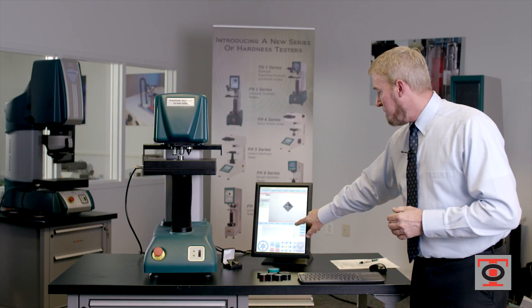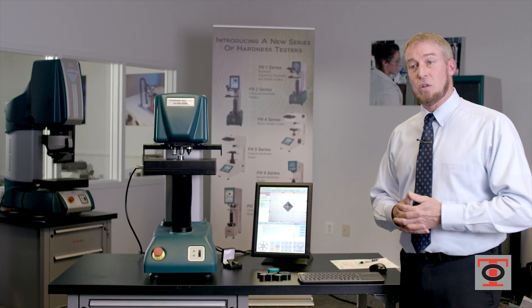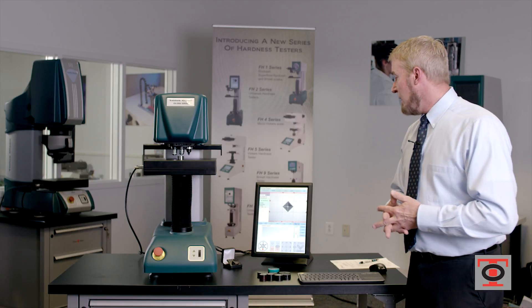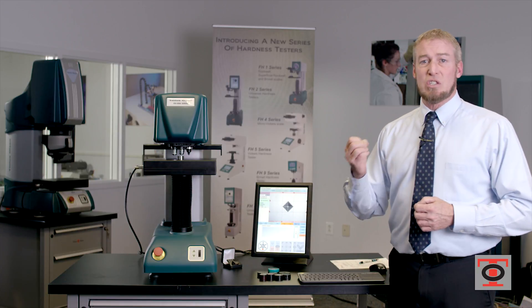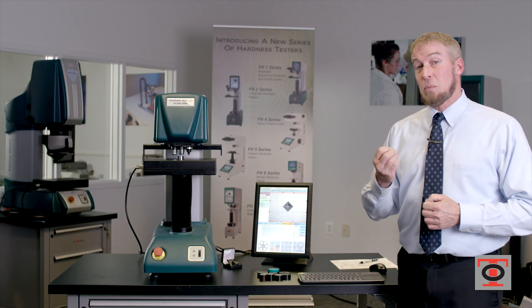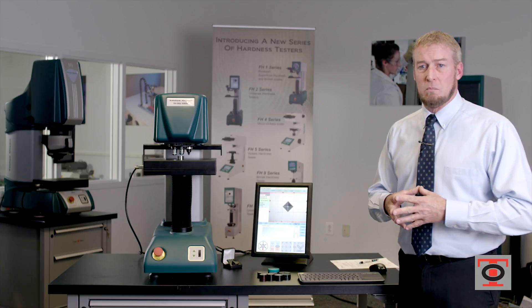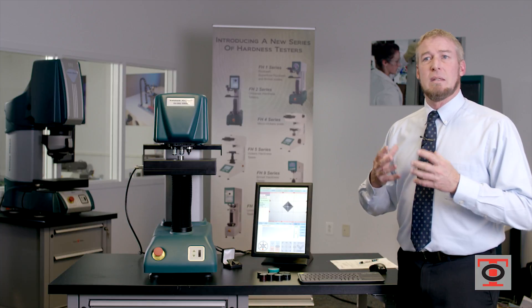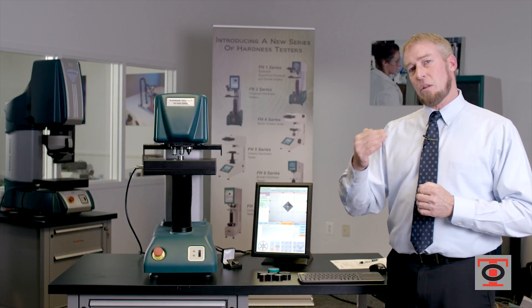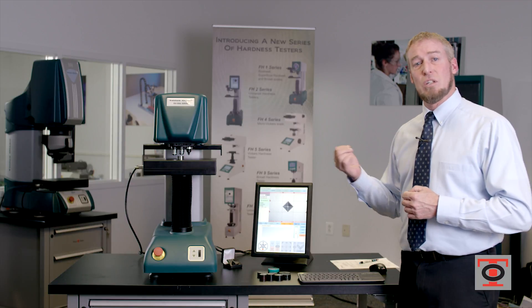Let's talk about the accuracy once we have focus. I'm going to hit the measure button. This is an automatic function, but for now I'm just going to display the measuring function. The measuring function analyzes the changes of pixels on the display, which is why it's important to have a 5 megapixel camera. Anything stronger than a 5 megapixel camera doesn't enhance it — that seems to be the threshold of getting the greatest reading of an indentation through digital optics.